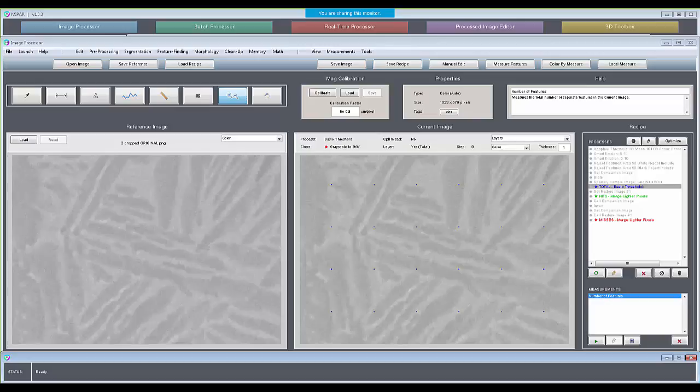I don't know that we can do 3D point counting out of reconstructions yet, but we can export random cross sections through a 3D reconstruction back out into images that you could then point count. I'd probably recommend we have a custom session to show some of those tools. Is there anyone around here that wants to see 3D analysis of one example data set? Or do we want to open it up to more questions and close out?